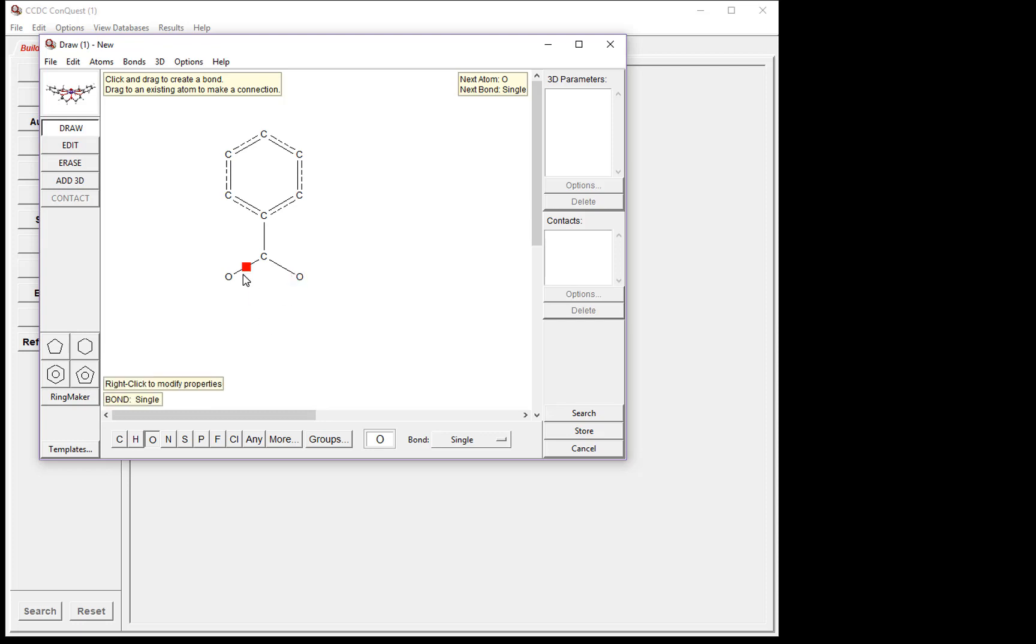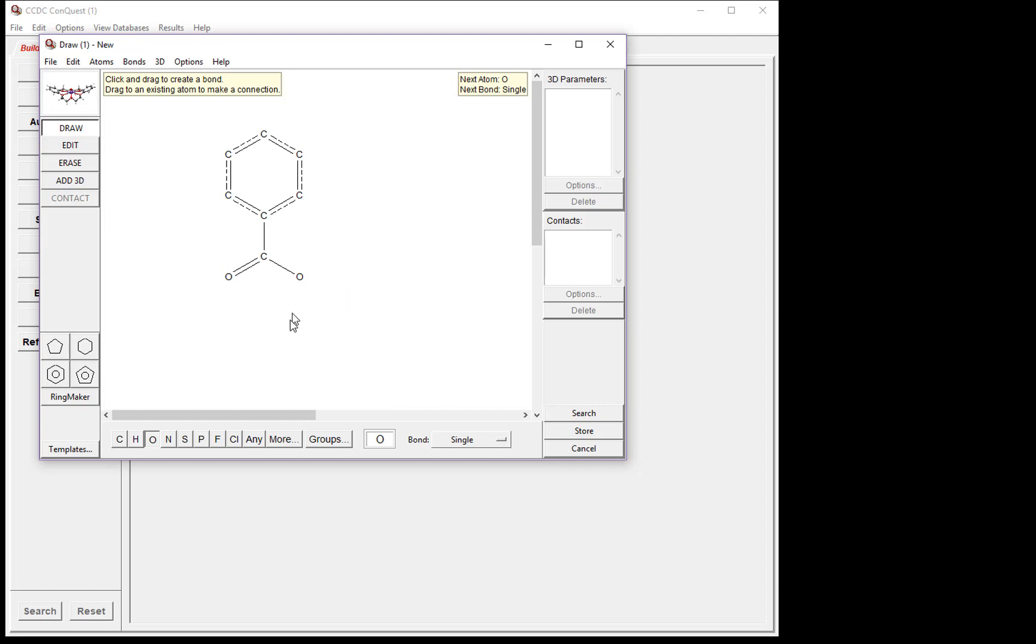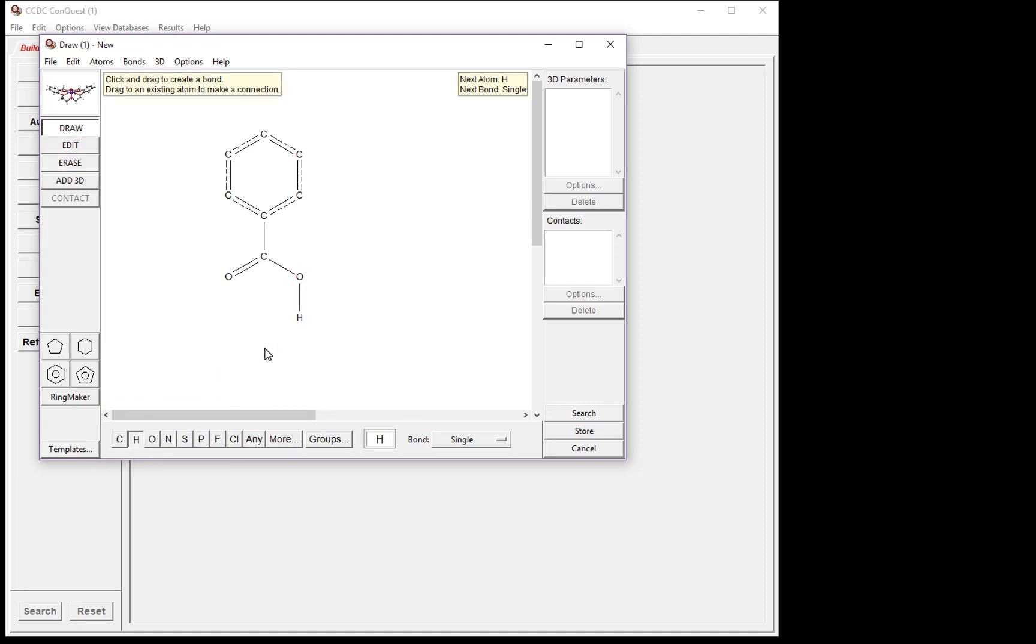One of the oxygen atoms needs a double bond. To do this, right-click on the bond and choose Type and Double. Finally, we need to add a hydrogen atom on the other oxygen. Select the hydrogen from the atoms list, click the oxygen, and drag down to create the hydrogen. Now we have our first fragment drawn.